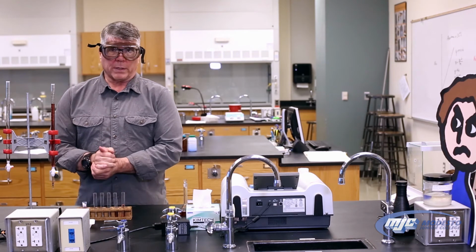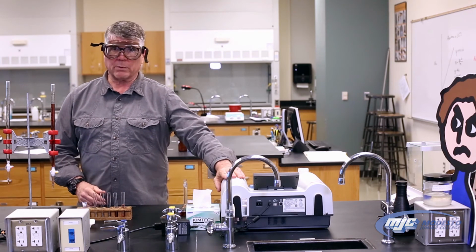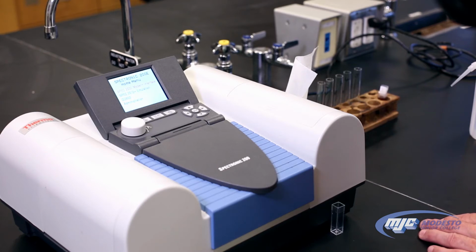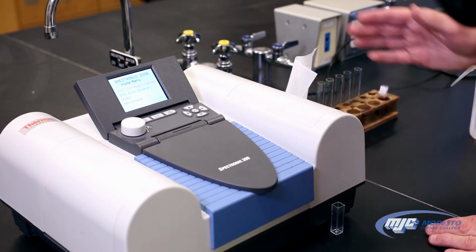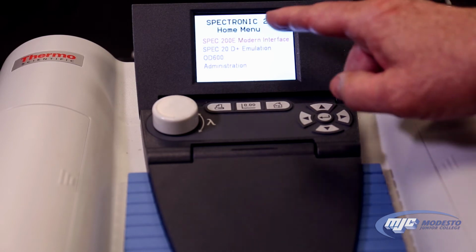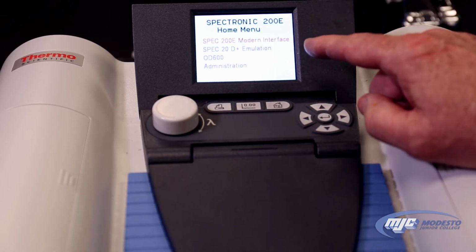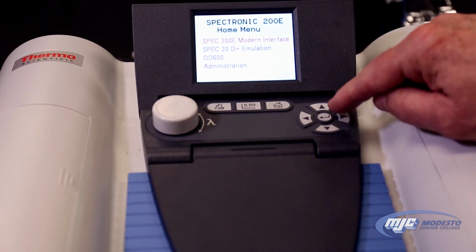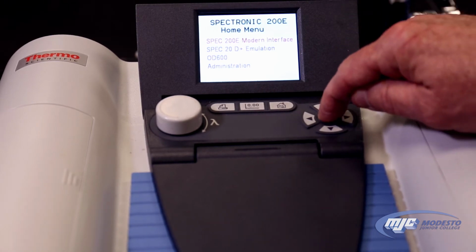Now we're ready to come over here to the spectrometer and make our standard curve. All right, guys, so now we're ready to measure the absorbance of our stock solutions as well as our unknown. First thing we're going to do is when we come up to the spectrometer, it should be on the home menu, and the Spec 200E modern interface should be red. That's the one we use. So what we do is we press enter, which is this button right here.